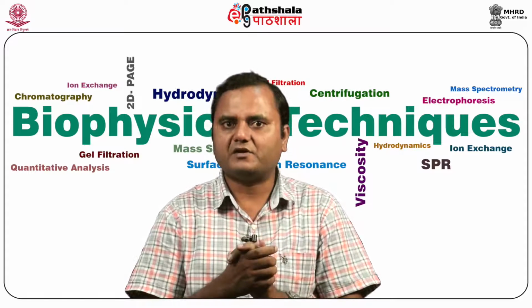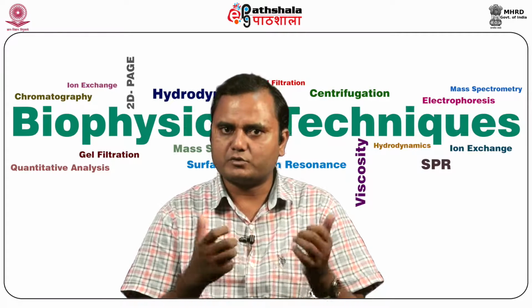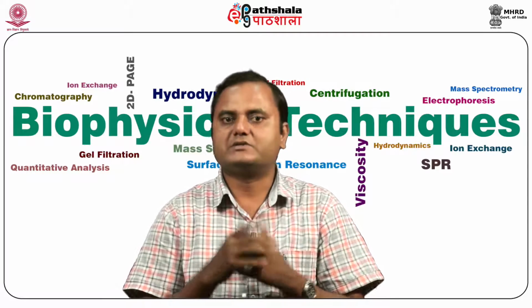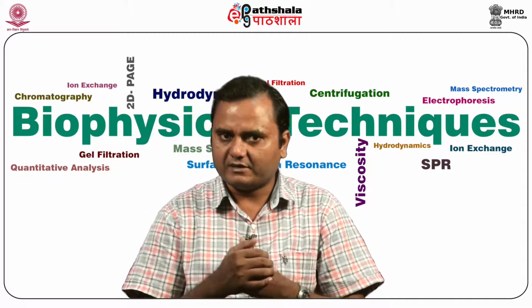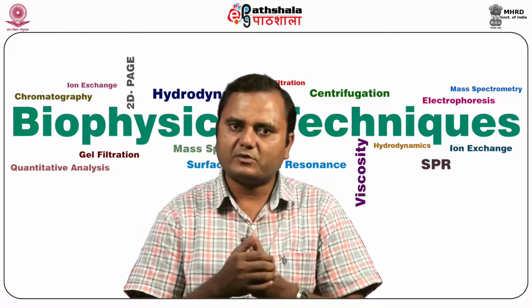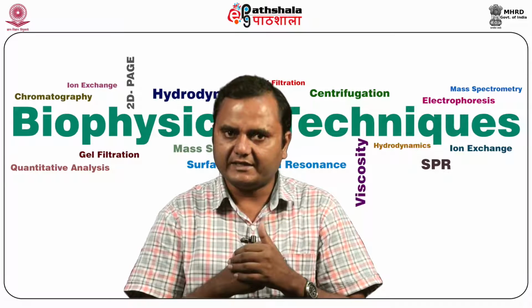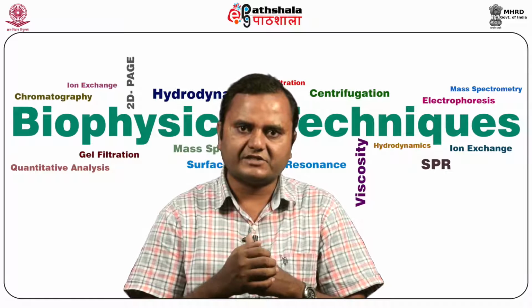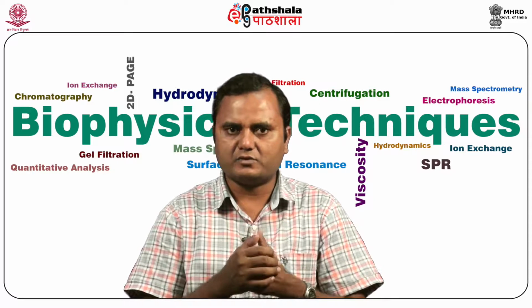This can be used to pellet the membrane, ribosomes, and other cellular organelles. They are used in the preparative or both in the analytical, and gradient systems are used, like the cesium chloride gradient for the separation of DNA, and the sucrose density gradient used for pelleting cell fractions, small proteins, ribosomes, etc.